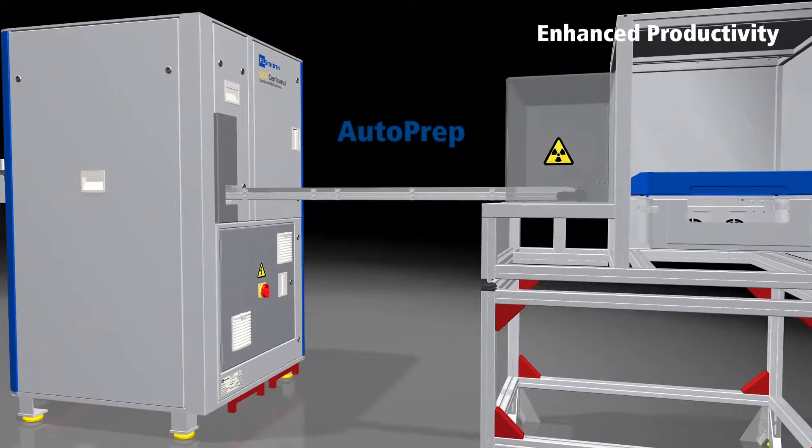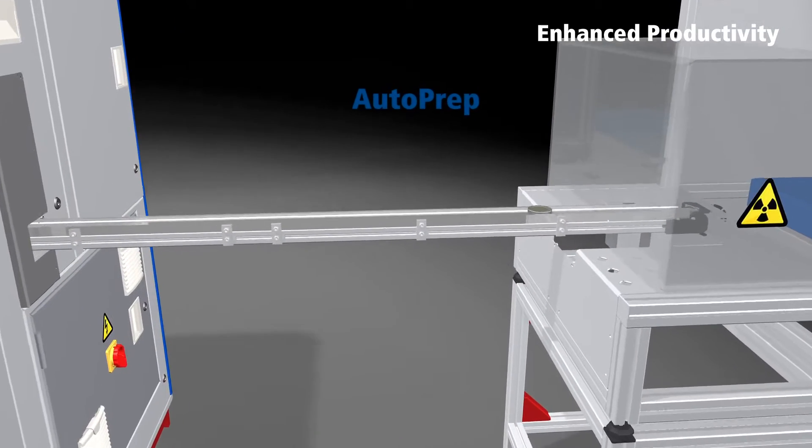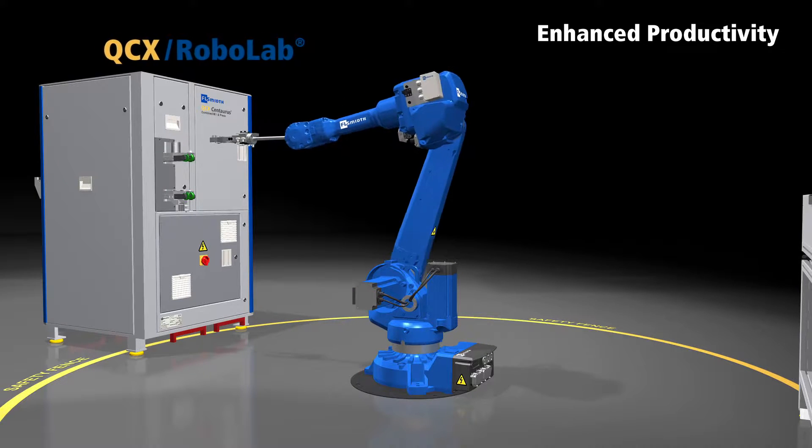AutoPrep — where the Centaurus is directly connected to the X-ray analyzer and can also be connected to the sample delivery equipment. Robo-Lab — where all sample handling is handled by a robot.